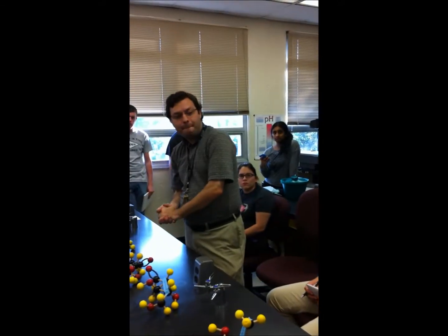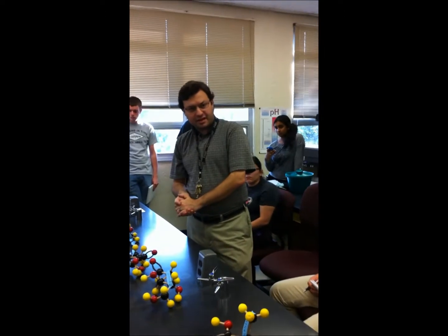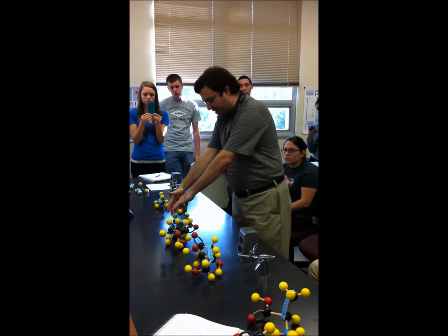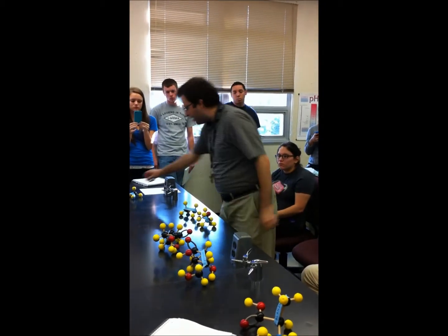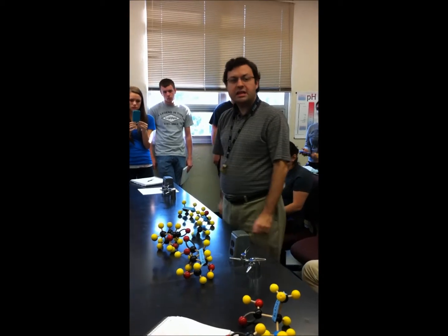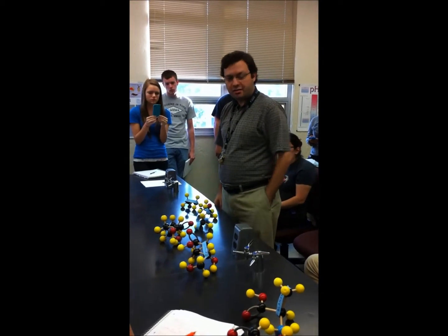Yeah. So for the lab practical, we have to tell what each of them is. There are 3 ways that they're going to ask this question. They may take one of these, set them out without the tape on it, and go, what is this? Okay, that's one of the basic questions. Second one, they'll take several of these, put them right next to each other, and they'll go, which one, A, B, or C, is the ethyl alcohol? And then you'd have to select which one's the ethyl alcohol.